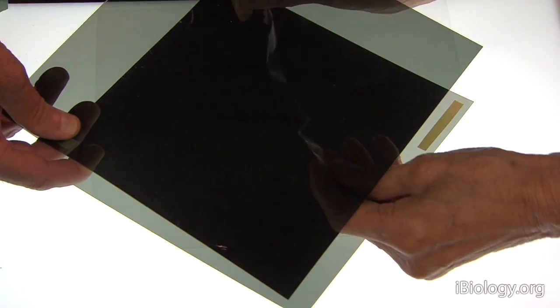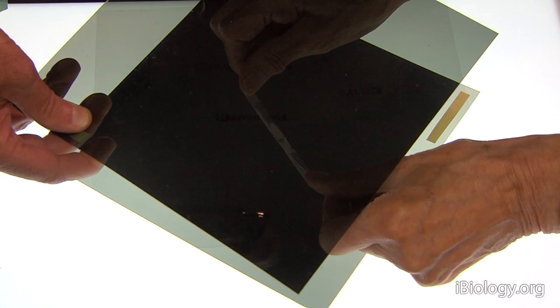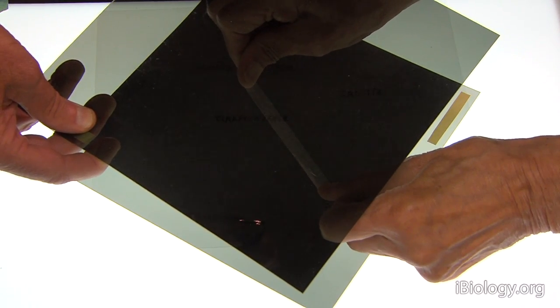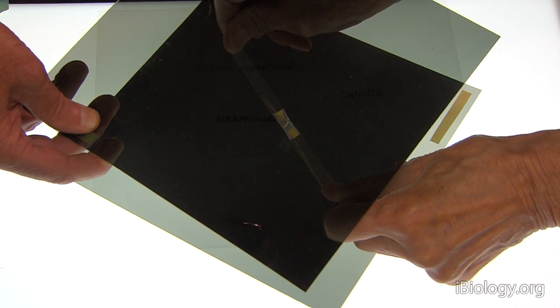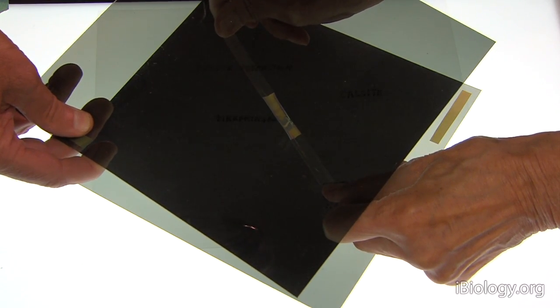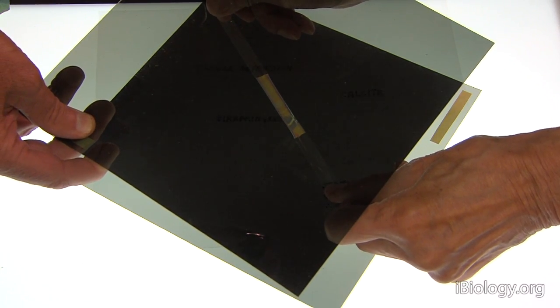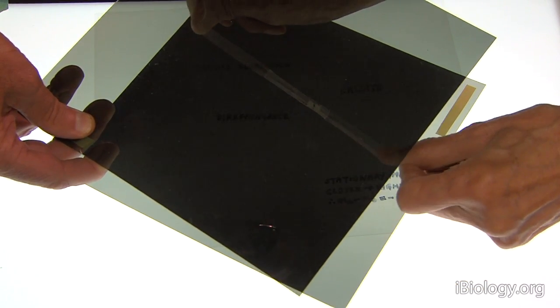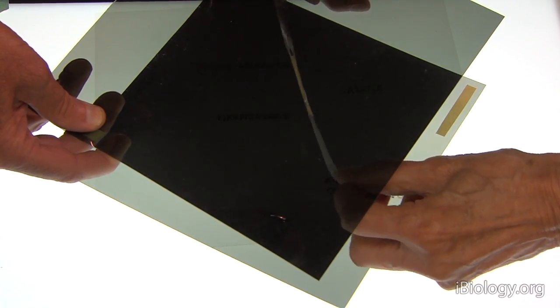What the birefringence is showing us is that molecules are lined up. What I'm doing is taking this piece of plastic and pulling it so that the molecules line up. It should become bright and even show color. As you see here, lining up the molecules made this a birefringent material, changed it into birefringent material.